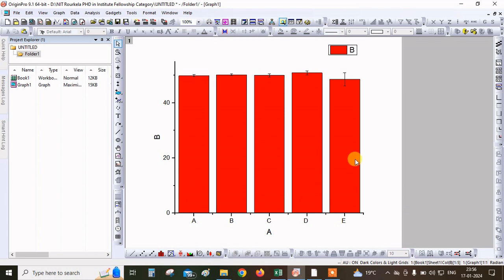Okay. Now first of all what we will do is we will delete this part. Now we have to make some changes in order to represent it in a much better way. What we can do, we can change the labels here. Here will always be your percentage moisture content. Percentage moisture I am writing for our demonstration.